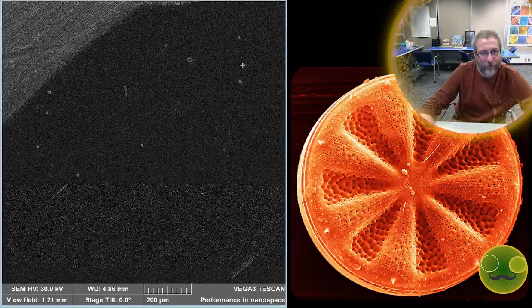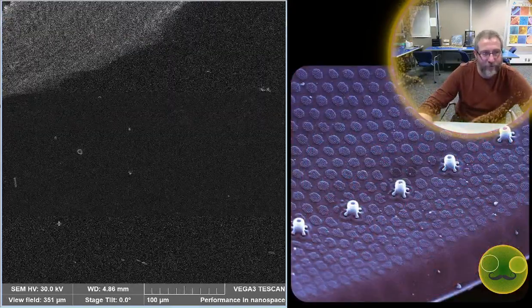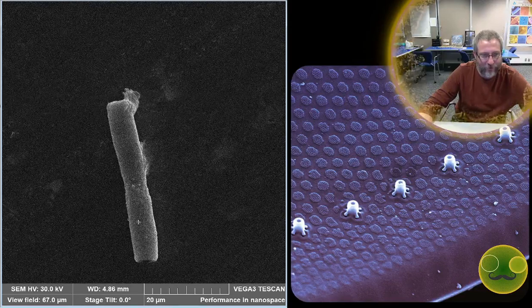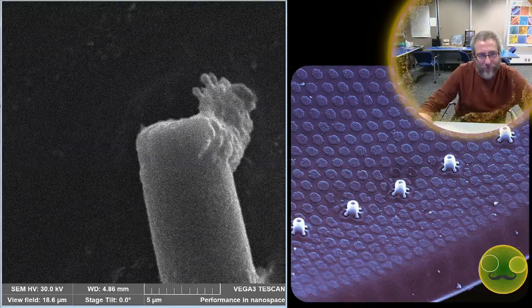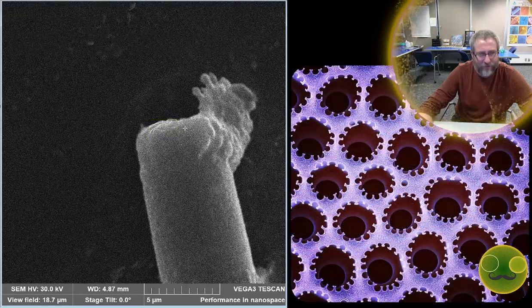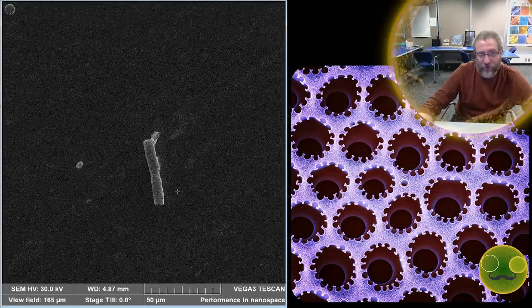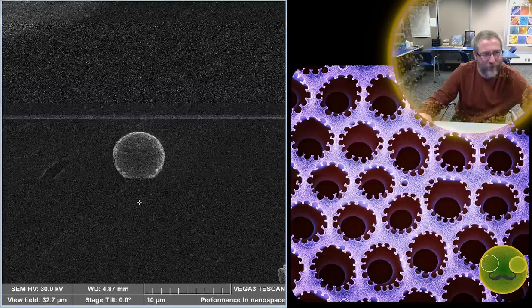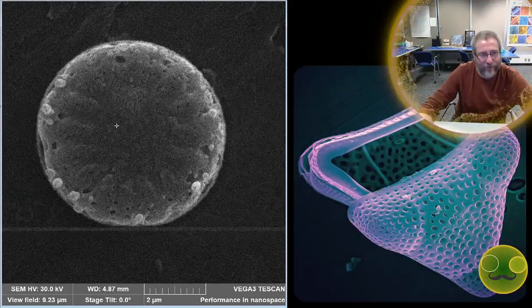Normally when we prep them, we put a little bit of water on the stub and then we add the material from the original samples. Look at this crazy tube it's made. Look how long that is. It's ridiculous. Just keep adding girdle bands. And so, like I said, sometimes we just use a little bit of water to reduce the total number of diatoms that are going to be on a stub. But for these, I think we actually just put them straight in, straight concentration from the way that we had them. And it still is not very dense.